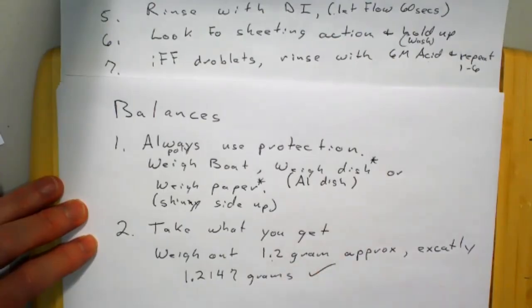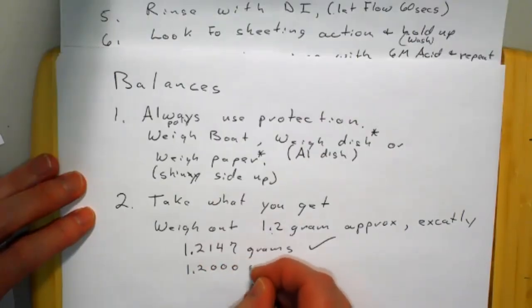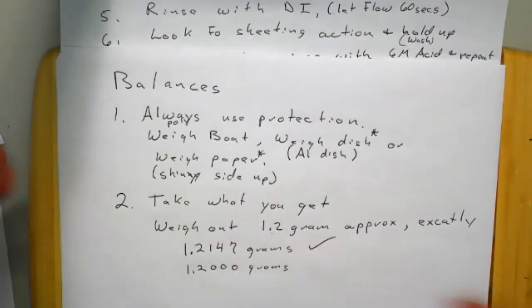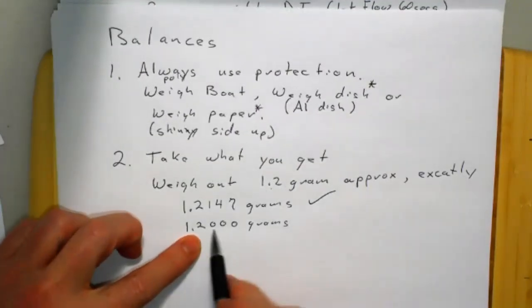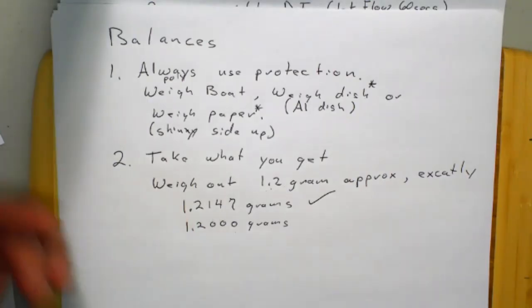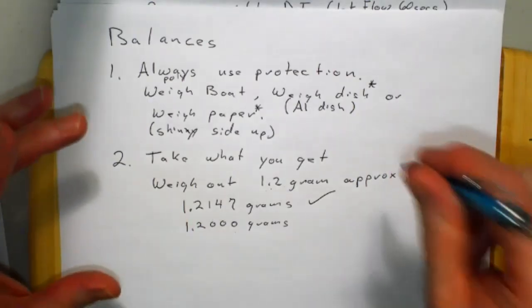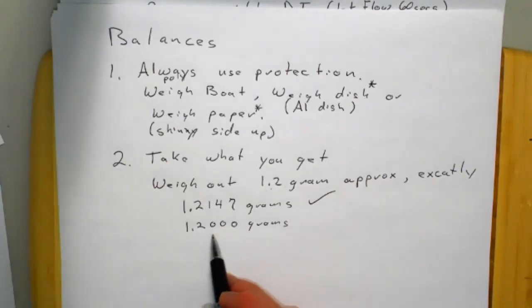is checkaroony. Okay. If I look in your book and you got 1.2000 grams, it better be your lucky day. So it's a huge waste of time to try to get these things to exact masses. Instead, just go, and it helps you be a little more honest when you're doing your titrations. If everything was 1.20000 grams, you'd sort of be biasing after your first titration.